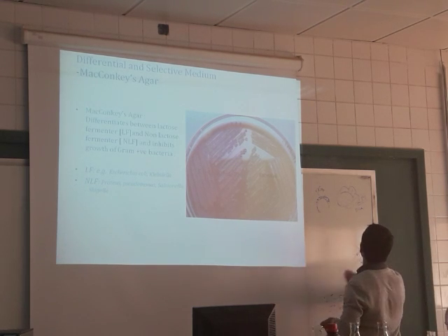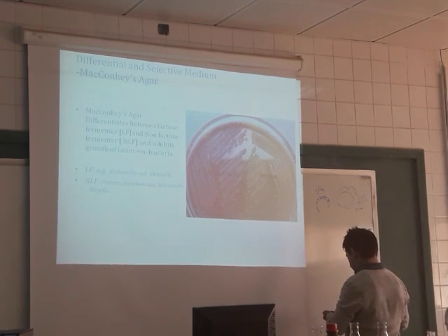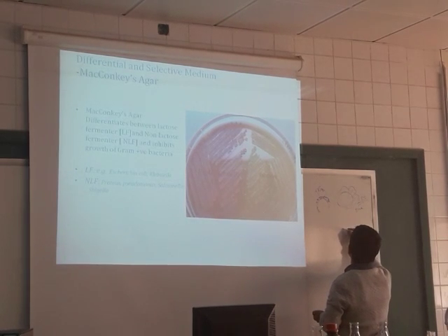There is no pigment. It is a lactose fermenter. Tell me why it is pink in color. The presence of pigmentation? No pigmentation. Because it is a lactose fermenter.